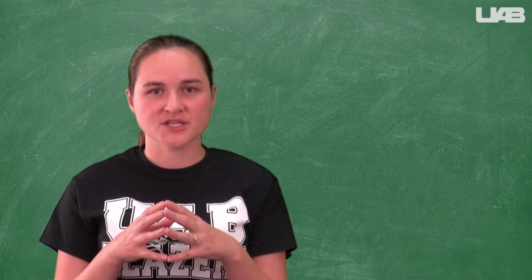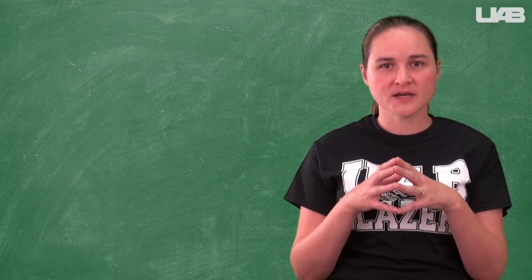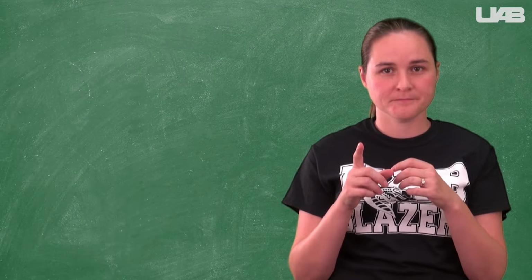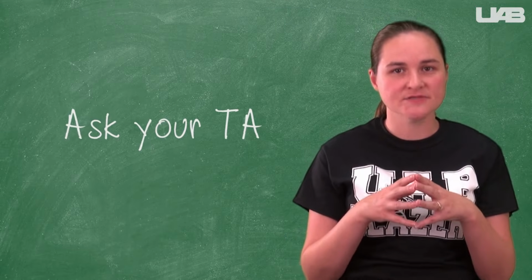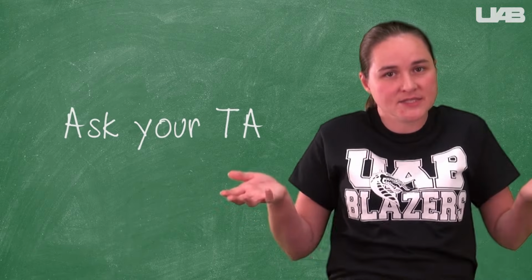The energy of the reaction can be observed by a temperature change of the solution. We are not performing our experiments on a scale that allows us to measure a temperature change effectively. But if you're not sure whether a reaction is taking place, talk it over with your TA and decide if it's a good idea to do the reaction on a larger scale, say in a test tube.